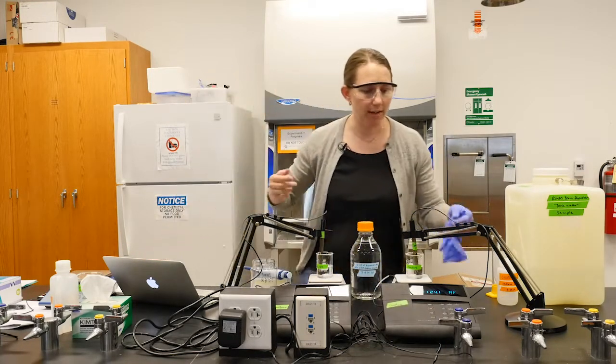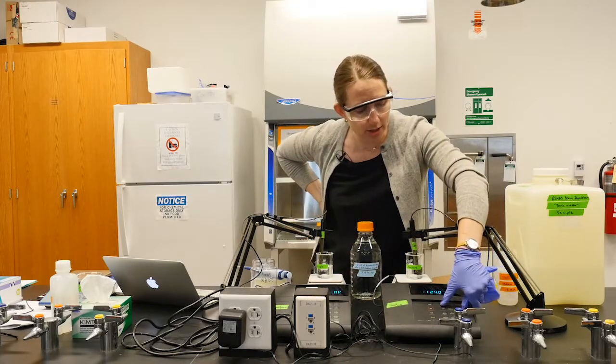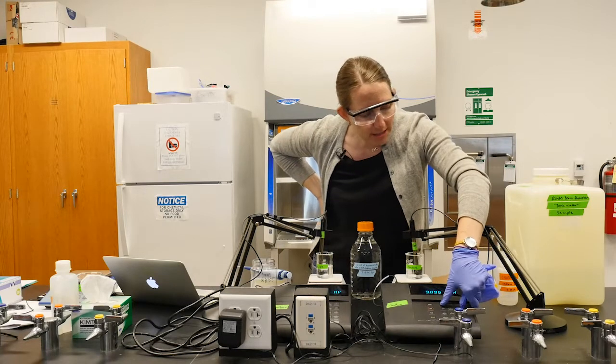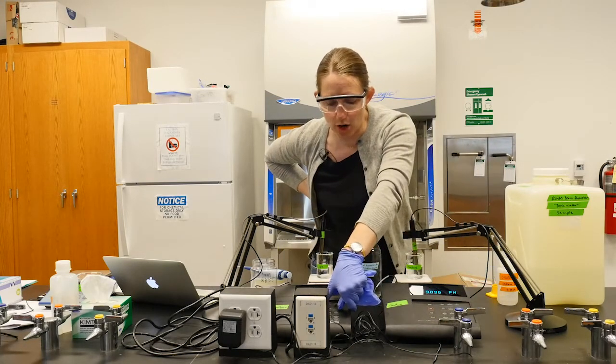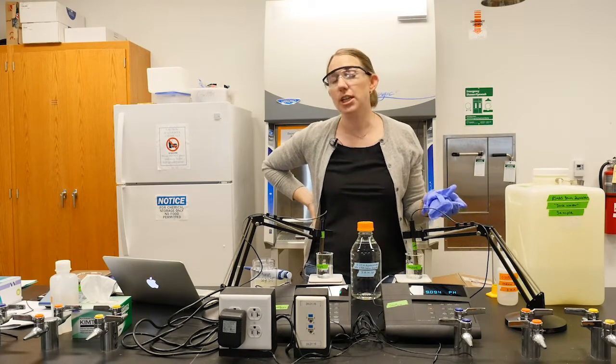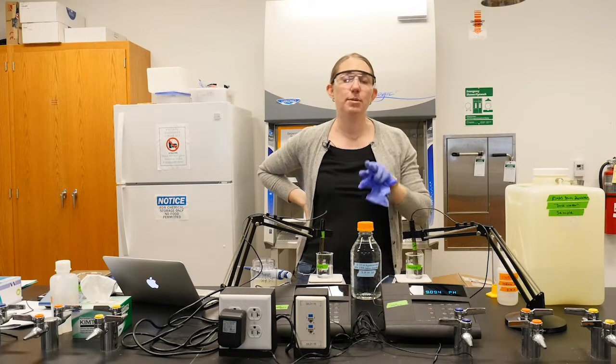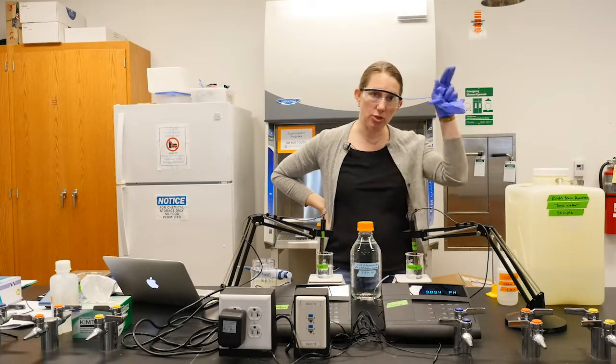And then one nice check: these meters measure pH as well, so we can just change the mode. This gives us a good sense of what these samples are that we're starting with. And the pH is a good indicator for when you're done with this titration. Again, we're adding acid, and so we're going to be decreasing the pH, so dropping in number.